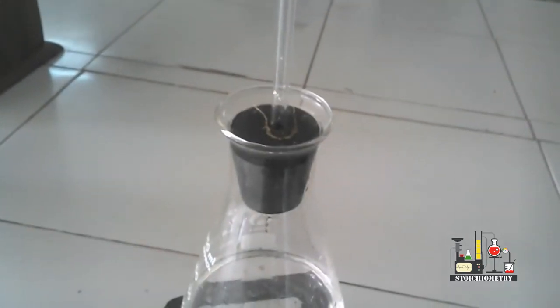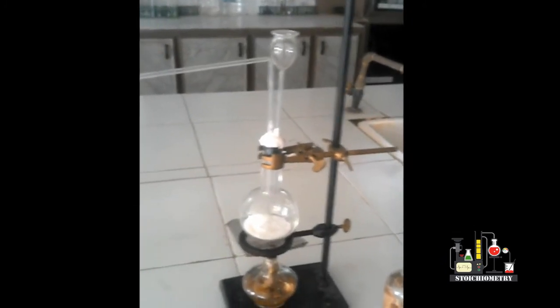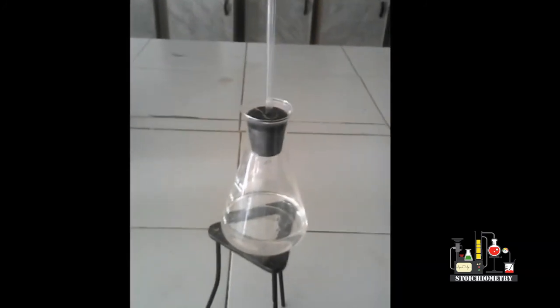Take a round bottom flask and add solid sodium chloride into it. A delivery tube and thistle funnel is attached to it. The other end of the delivery tube is fed into a container where saturated solution of sodium chloride is taken.